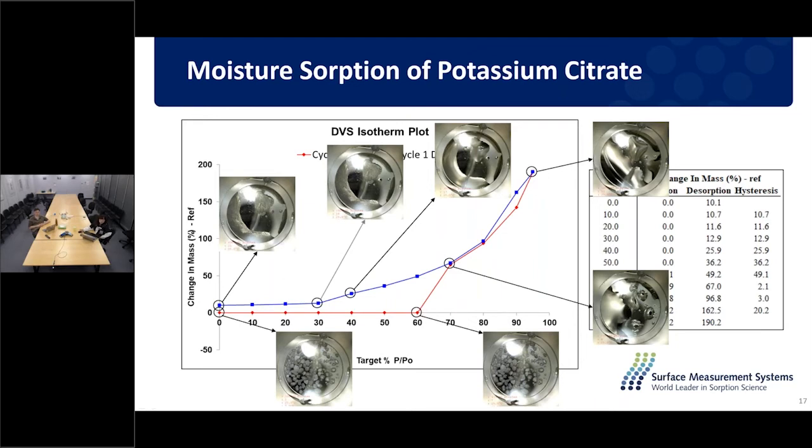So basically here you can study how the morphology changes along with the humidity from the combination of the DVS technique as well as the video cameras.